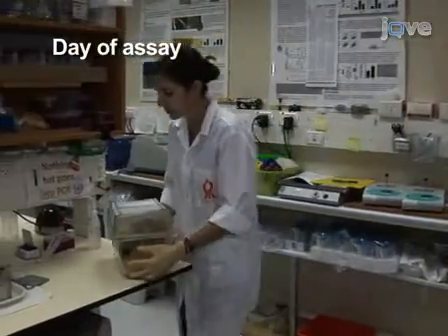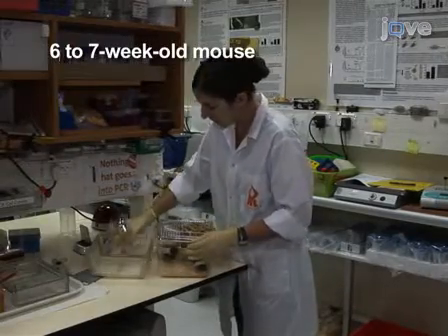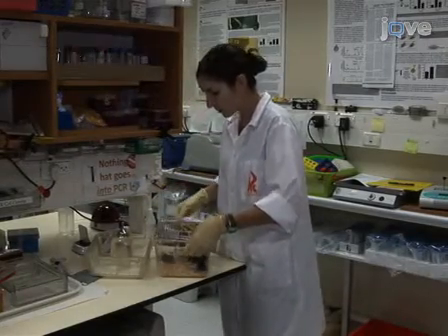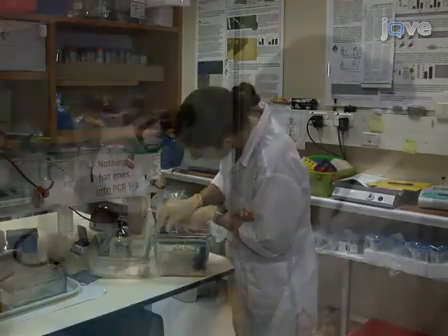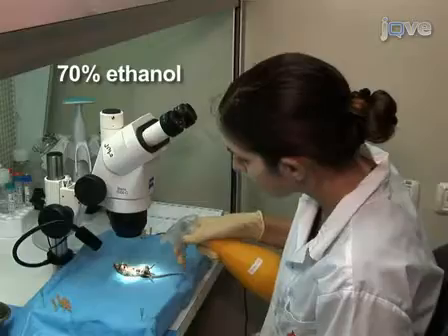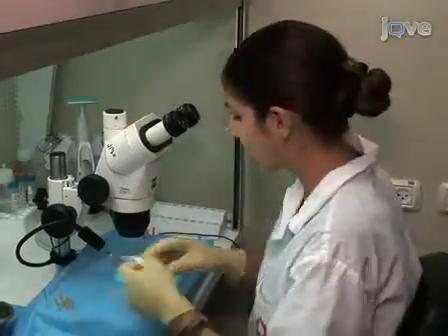On the day of the experiment, euthanize a 6- to 7-week-old mouse by a standard ketamine and xylazine injection. Bleed rapidly through the neck arteries, followed by cervical dislocation. Begin the procedure by wiping the animal with 70% ethanol in a sterile, laminar flow hood.